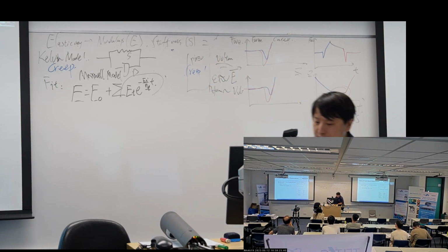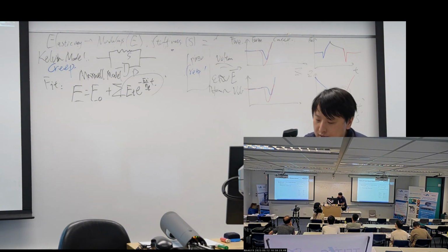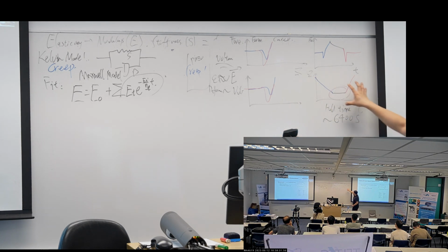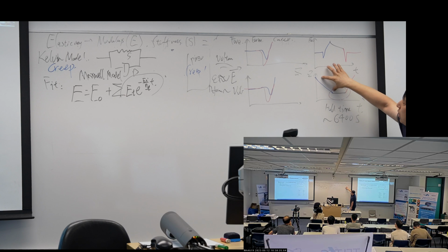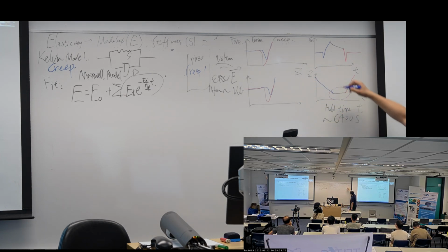So let's take a look at this hold. How we achieve this kind of movement is we apply a voltage, and we change the voltage linearly until I extend my piezo. And then I want to hold my movement, so I want to hold the length there. How do I do it? I will hold the voltage.